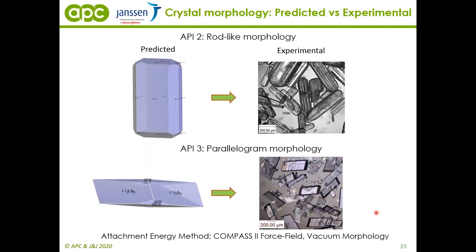So now, when I mentioned crystal shape, I want to go into more detail about that. So we are using crystal shape prediction also here in APCM, and crystal shape prediction is an active area of research. So different modeling approaches exist. For example, evolving from geometric, energetic, and also to the mechanistic, like spiral growth or Monte Carlo simulation. And here the prediction accuracy increases gradually, as well as complexity. And what we found most useful, and it's most widely used, is the attachment energy method. So it belongs to the energetic methods. And the reason why it's widely used is because it's simple calculations and relatively reliable accuracy. So it's quite valuable for screening purposes.